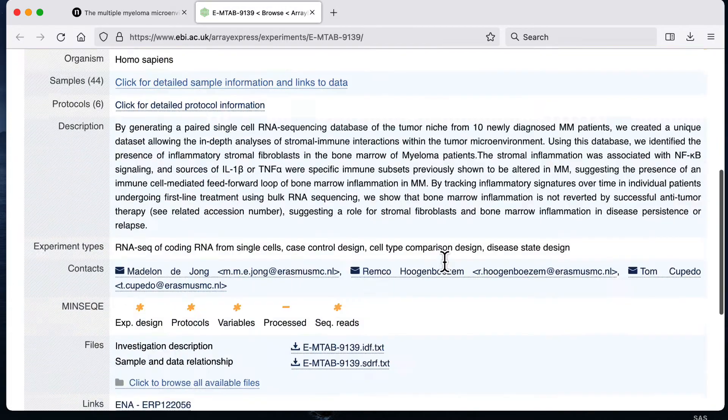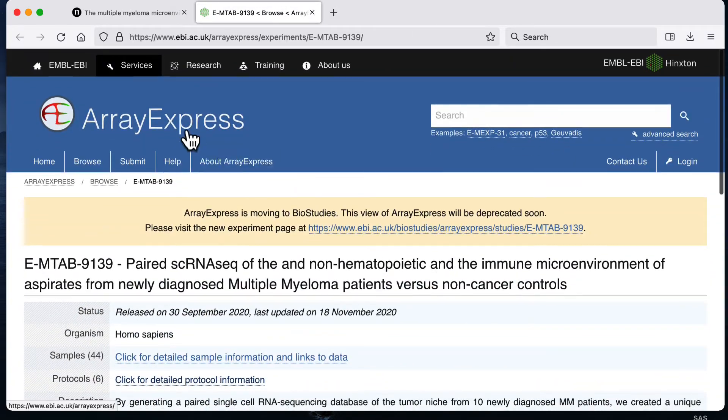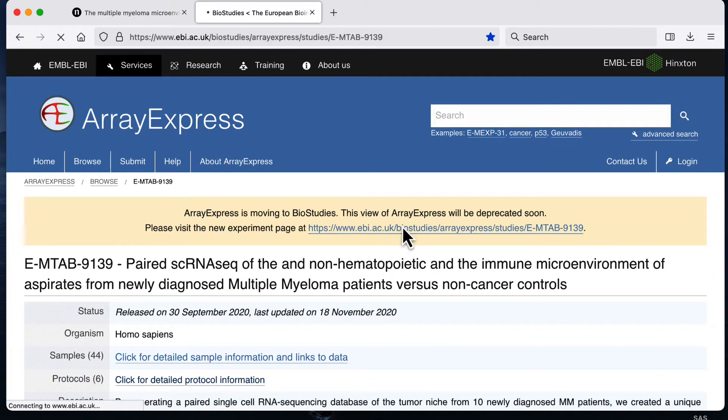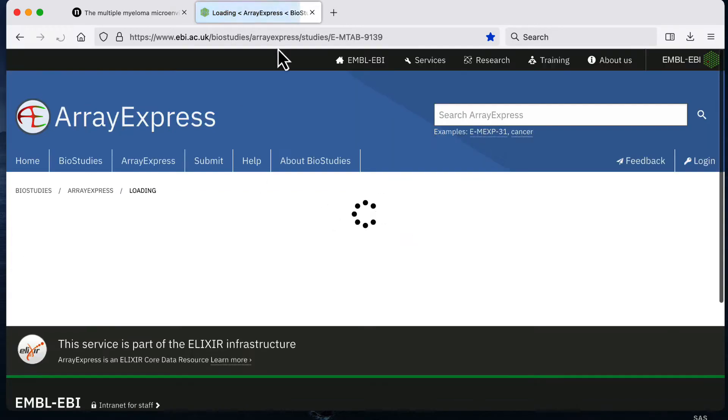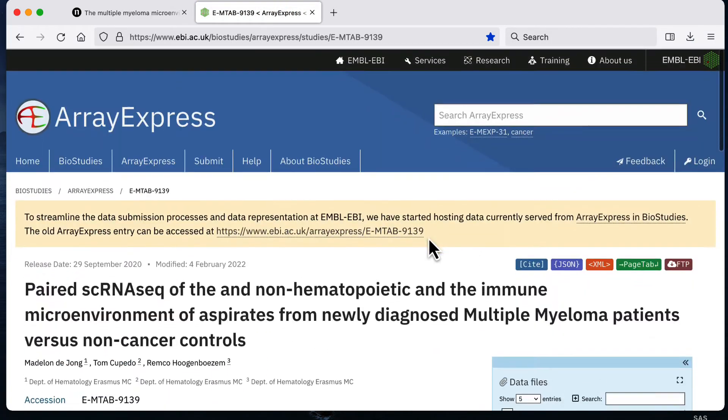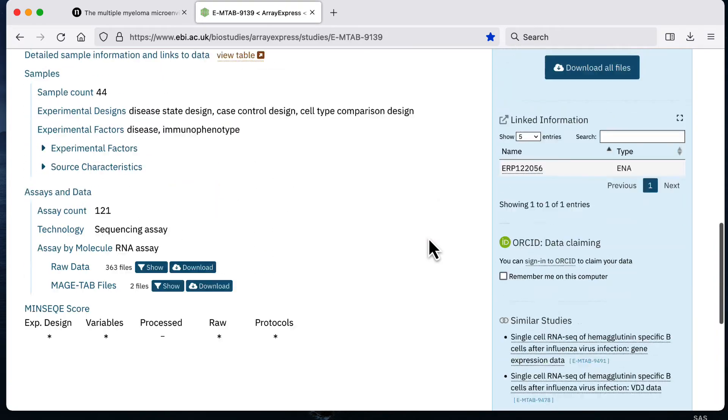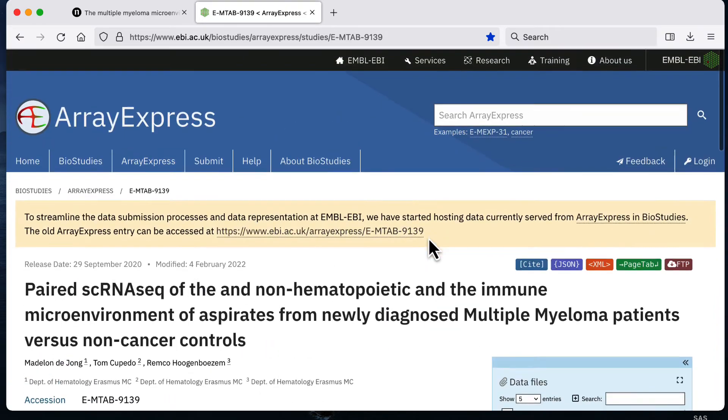This is how the website looks for me now when I click to go to Array Express and it says in the future it might look something more like this. Either way you can get the data on either version of the website.